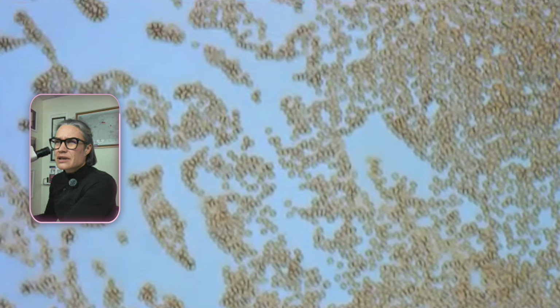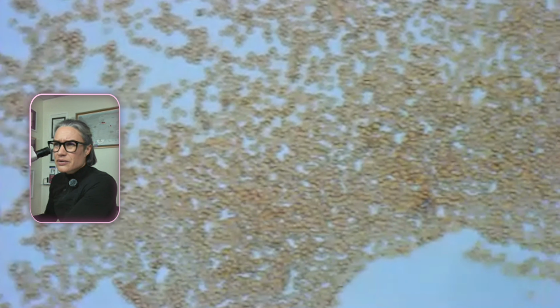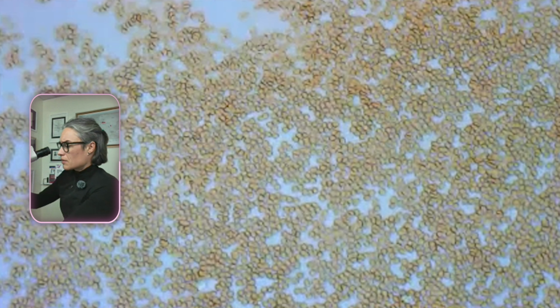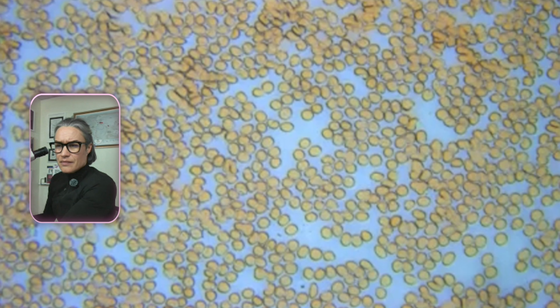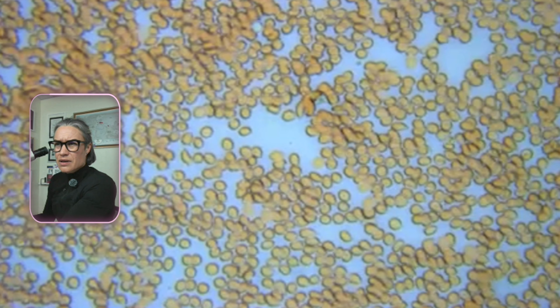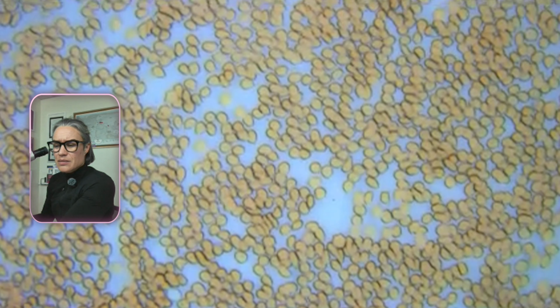I want to find a neutrophil. I saw quite a few there, but I'm not seeing anything here. Let me go lower magnification. Oh my goodness, they're so beautiful. Let me know what you think. I want to find a white blood cell. If you see anything, let me know that I'm supposed to stop.